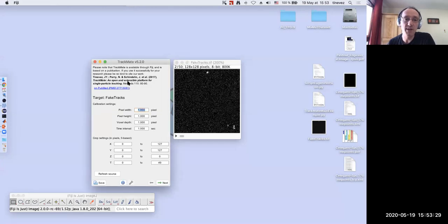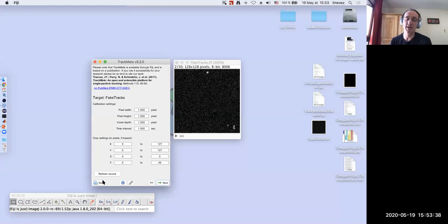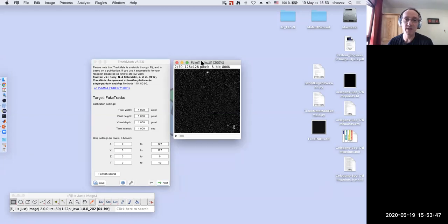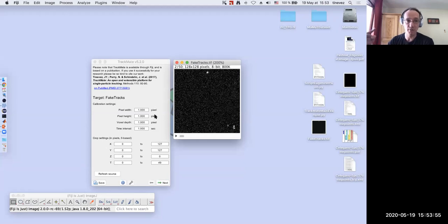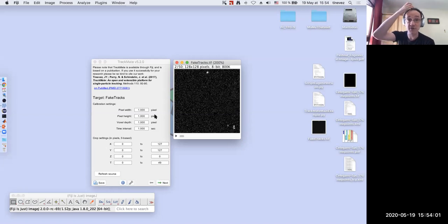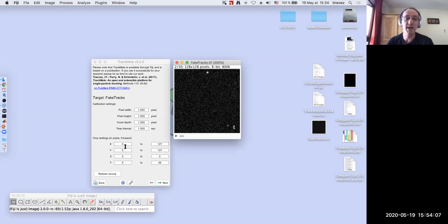If you launch TrackMate, it looks like this — with next and previous buttons and a log you can switch. You can save the session at any time. The first panel lets you verify that the metadata is set correctly. In my case the image is uncalibrated with pixel size of one pixel, but it's important to get it right because in TrackMate everything is stored in physical units — the physical location of spots X, Y, Z are stored in microns if your image is calibrated in microns. You can also set a ROI here.